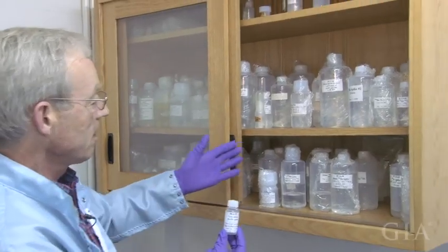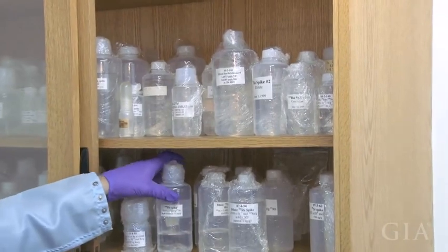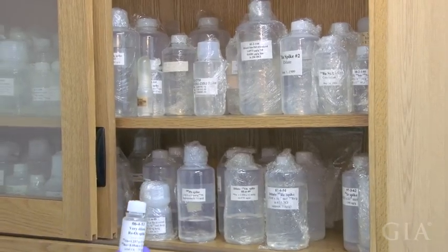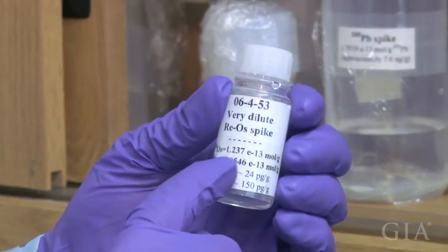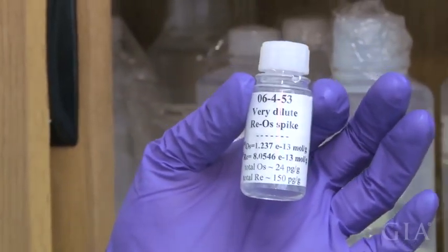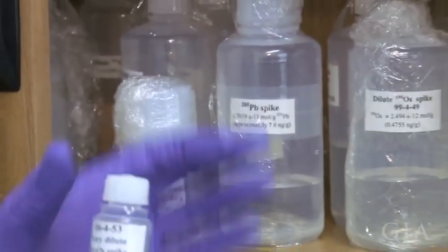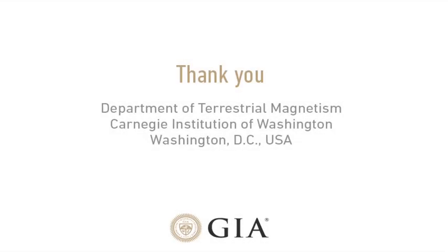You can see we have a whole cabinet here of tracers for all types of studies — some of these go way back. This is a lot of work to get these calibrated to the known amount. What's on the outside of the bottle is basically the concentration of the isotope in moles per gram, and to calibrate it gravimetrically is an awful lot of work. So we call this cabinet our family jewels — these are the family jewels in isotope geology.